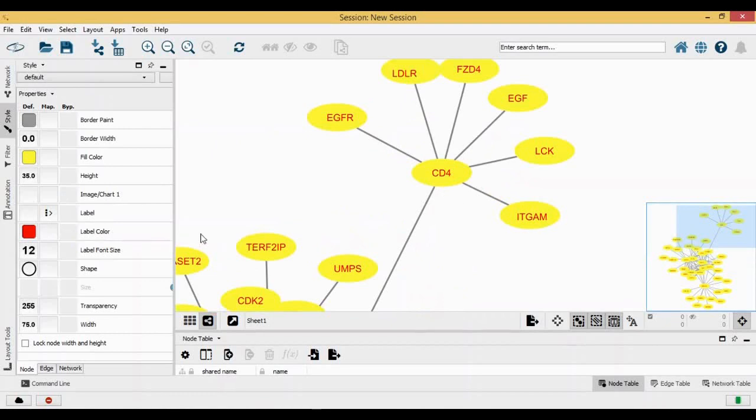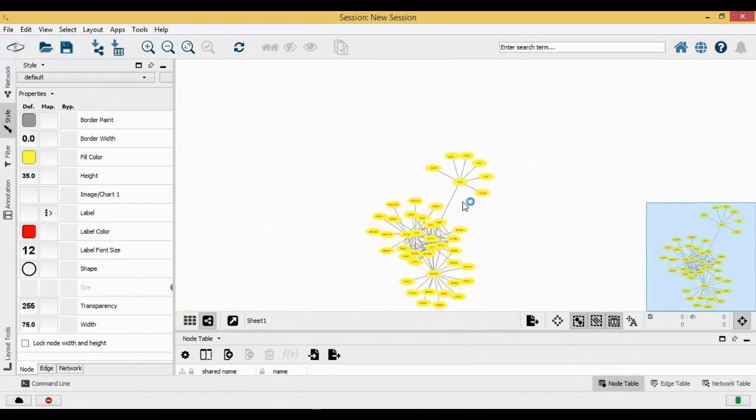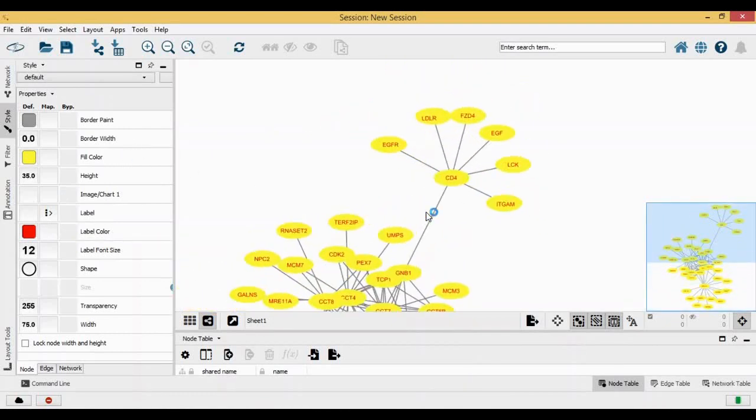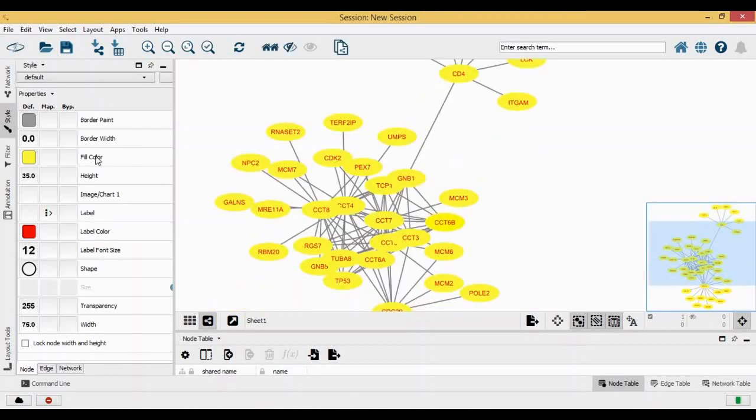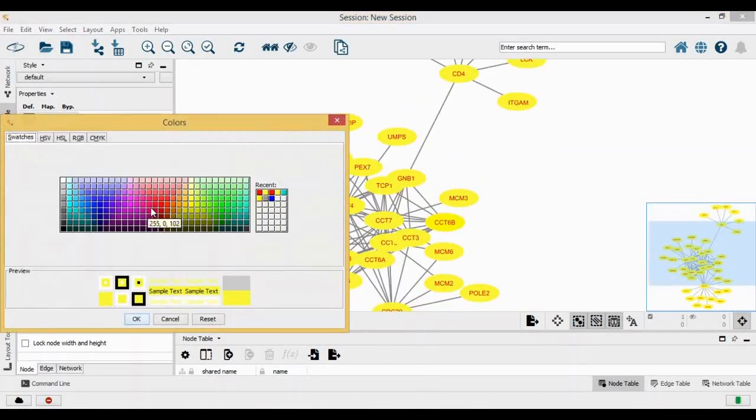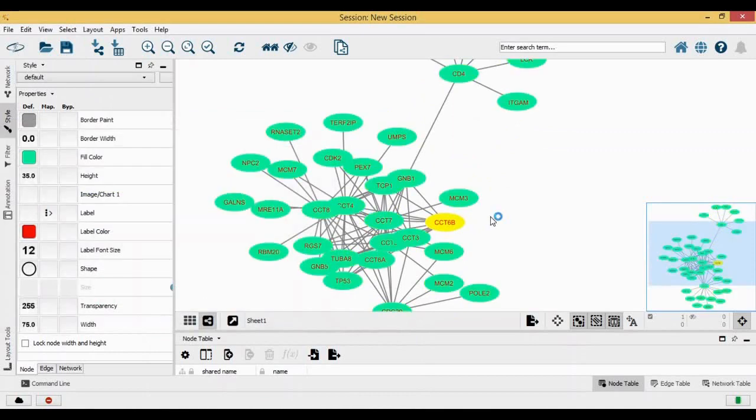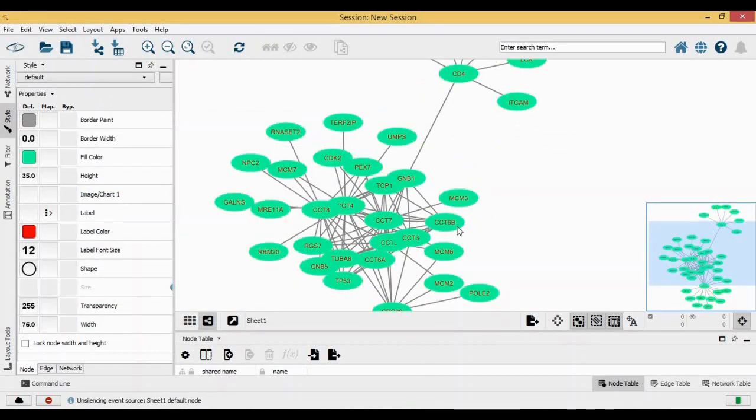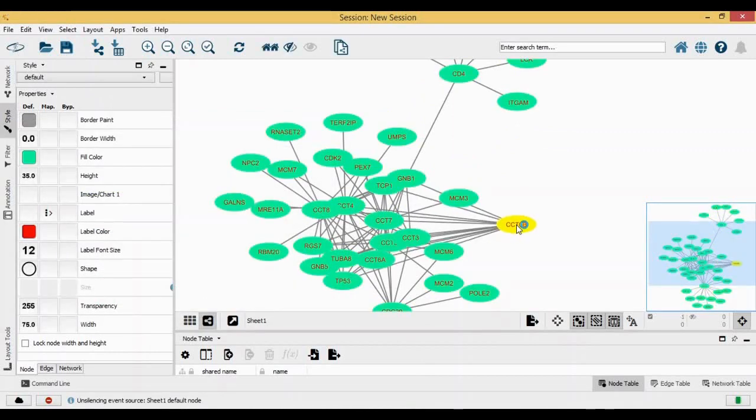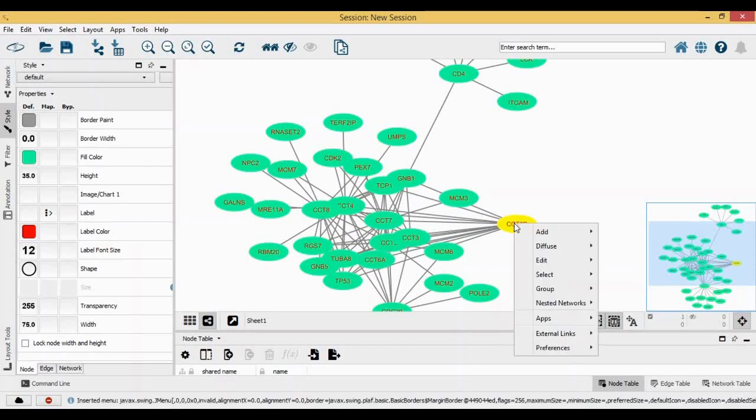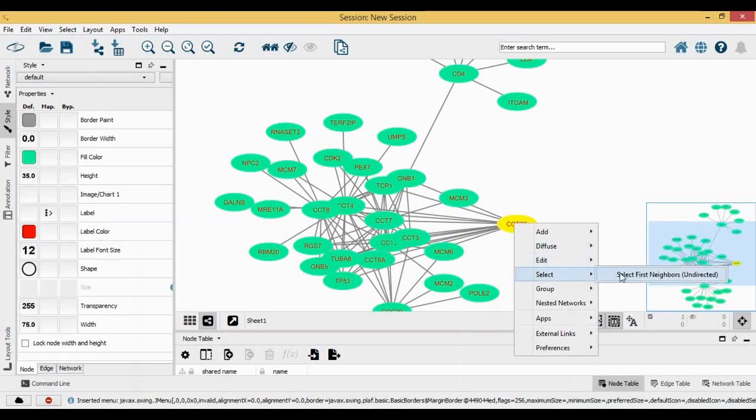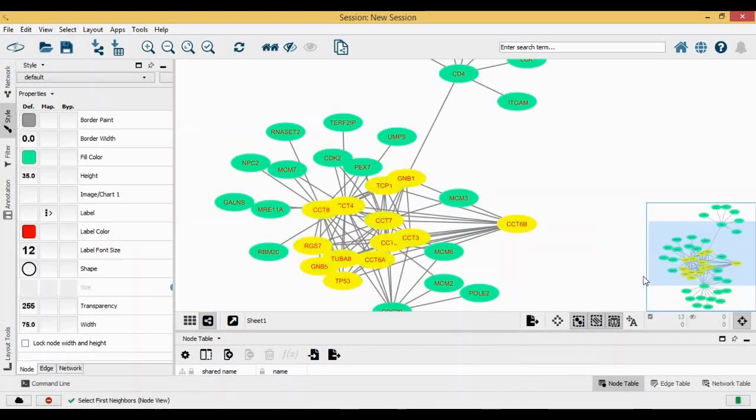Let's change the color back to blue for simplicity. Now as I told you, this is your hub gene. I want to know which are the other genes which are interacting with it. I just select it, right-click on it, and go to select and select first neighbors.